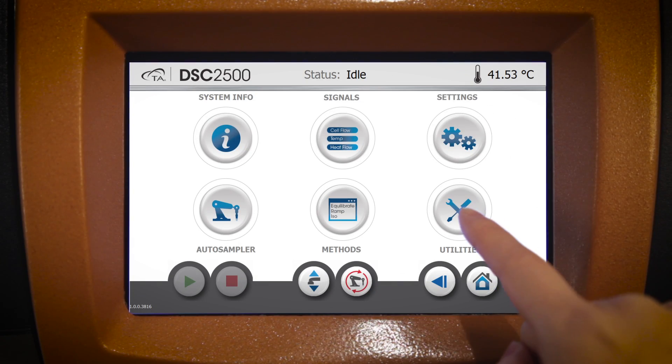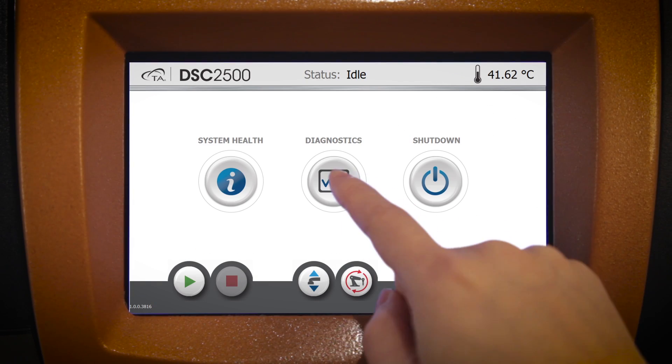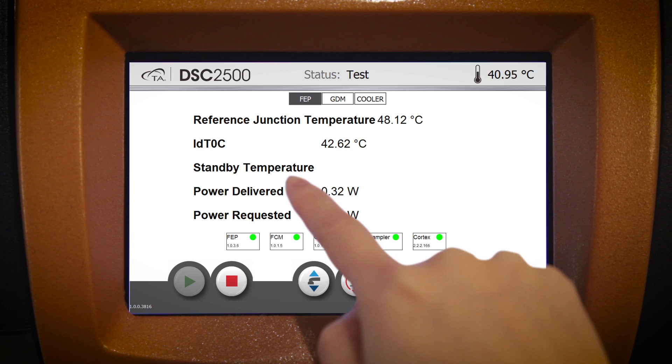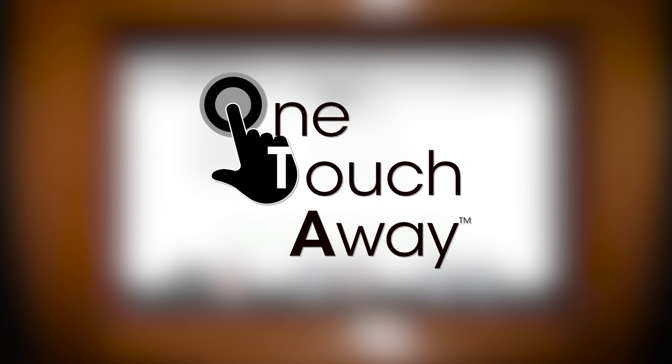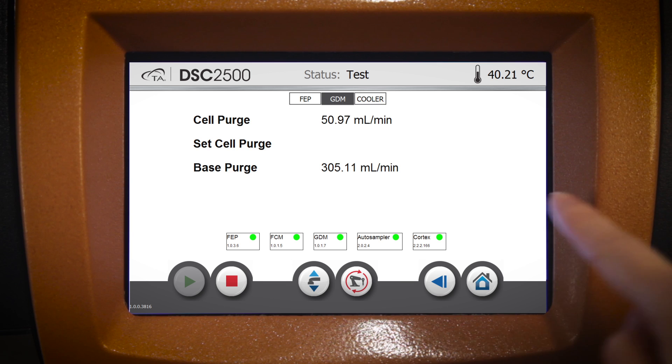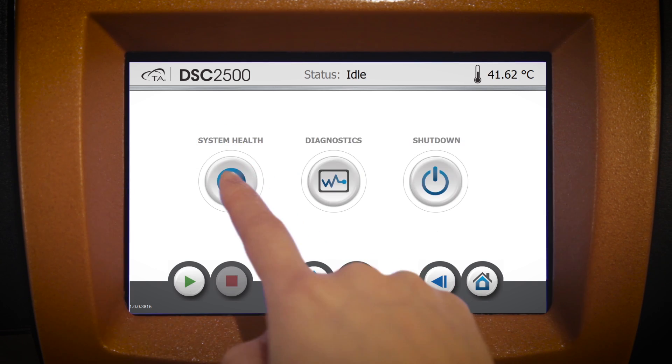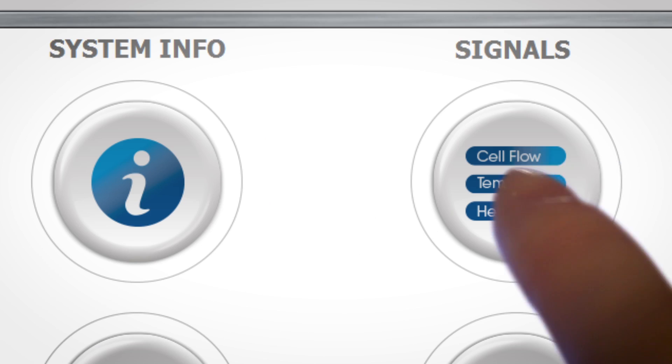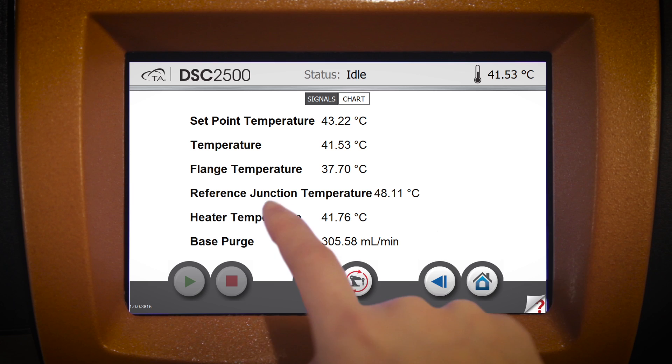An innovative new app-style interface, standard on all Discovery DSC instruments, includes one-touch-away functionality and our newest version of TRIOS. The new user interface makes operation easier than ever, providing an ergonomic design for easy viewing and generating great data.